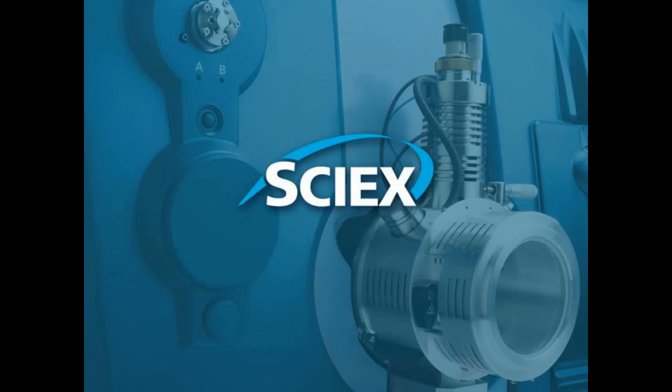Great, thank you. We have our next question. How repeatable is the separation of the monophosphorylated sugars? Again, very good question. I repeated this myself in the lab on 2 or 3 different capillaries, but I wanted to double check this. So what I did was actually transfer the method to a co-worker, Rawi, who's based in Leiden, who's worked with me on testing the method, and he actually then set it up on his system, and he repeated the separation. So I've confirmed that you can actually physically transfer the method to another institute in another country on a completely new system, and it's fully reproducible.